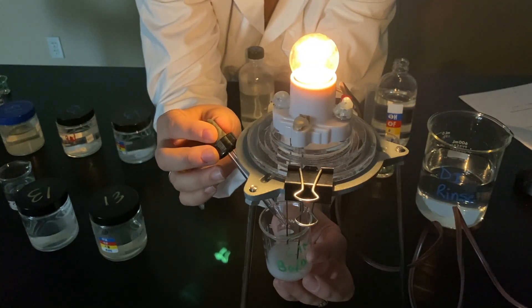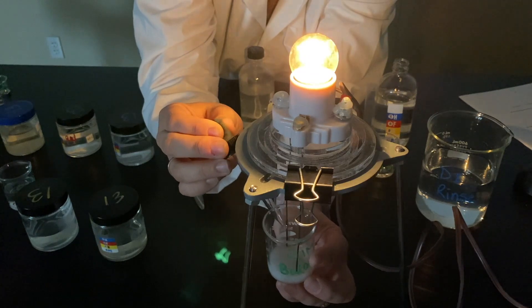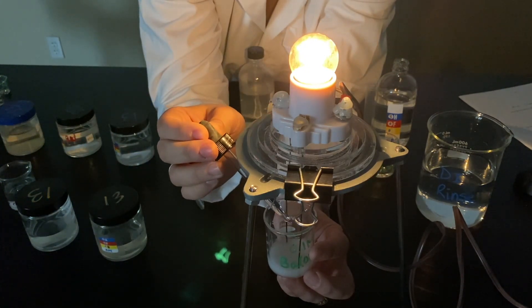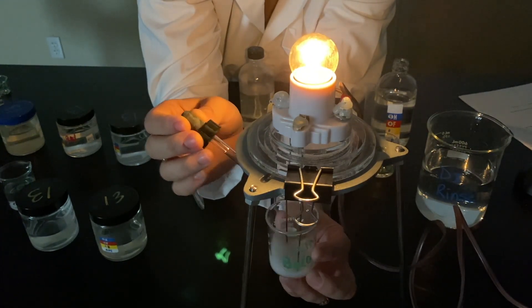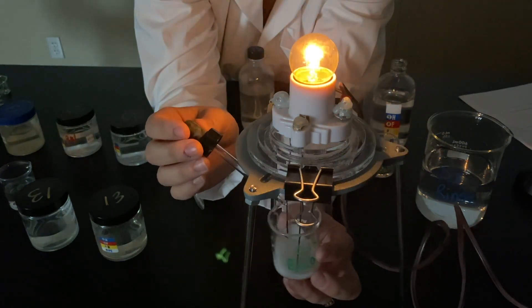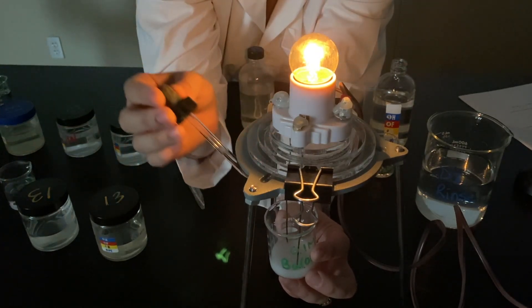The more I add, the more precipitate I get. Mix, mix, mix — boom. Hopefully you can see what's going on with the light bulb. The more sulfuric acid I add, the more precipitate is being formed, and something is going on with this light bulb.